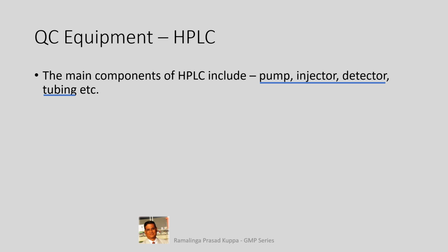Tubing is another important aspect. The size of the tubing between the column outlet and the detector inlet is critical. It should not be too long. Make a requirement in the design that the bends in the transfer tubing be minimum and no damages to the tubing. Damaged tubing can impact the analysis. Never make a 90-degree angle for the tubing. It restricts the flow because of constriction. This is all about the hardware part of the system.